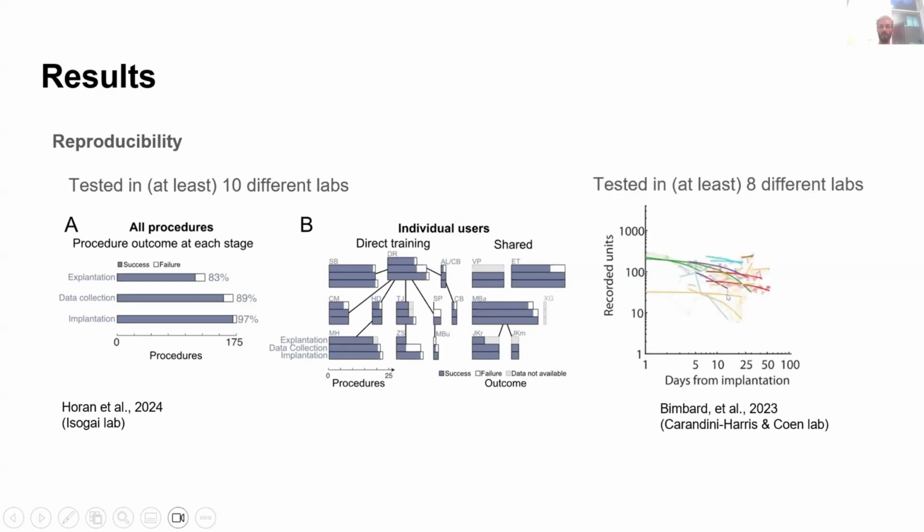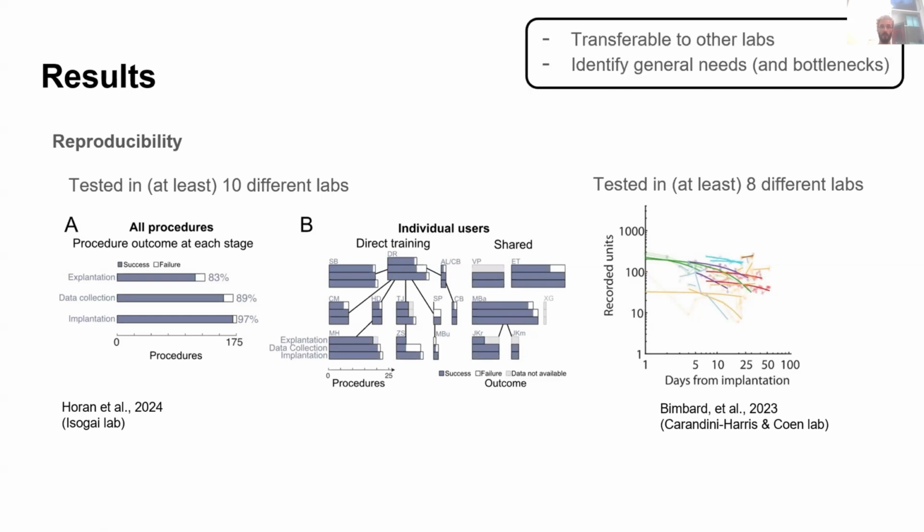And it's the same thing that we had in our lab, where each color here is from a different lab and the quality of the recordings was the same, even though these people were mostly not even trained by us when we designed the implant. Okay, so that's something that you may want to look into, whether it's transferable to other labs.